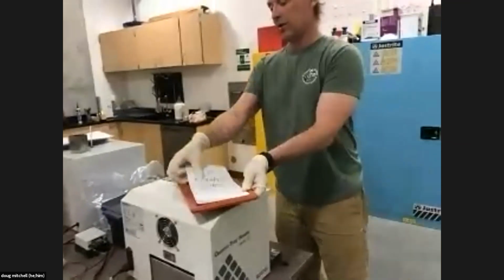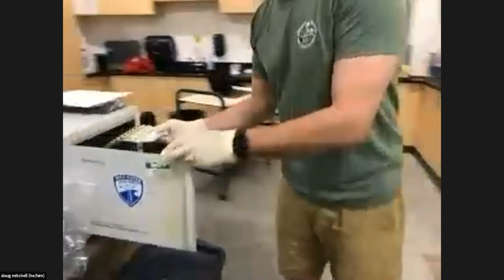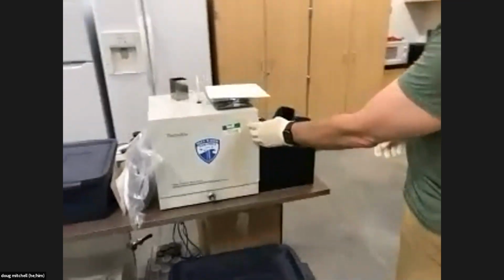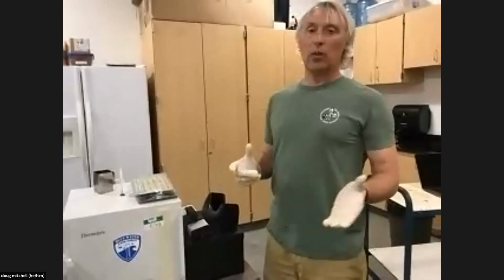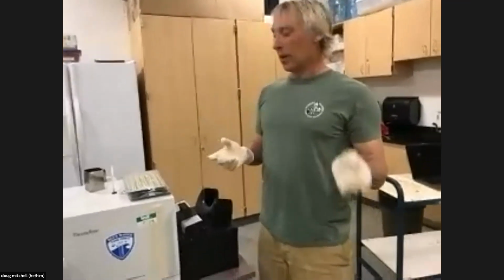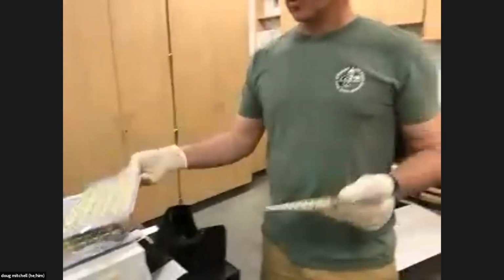All right, so we'll put this last sample in the incubator, and it's set at a temperature of 41 degrees Celsius, and these samples will stay there for 24 hours. To complete this process, what I did yesterday was pick up samples and process them so that they're ready right now to show you the back end of what actually happens.